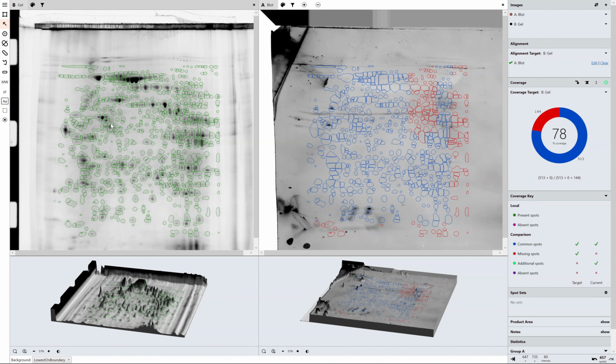All the changes are reflected across the same spot map across everything, so you've always got the same template to work to on each of your images, which again is really important for having this baseline to work against, to make sure that you're performing things the right way on every single image in a consistent manner, so your data is consistent and therefore reliable.